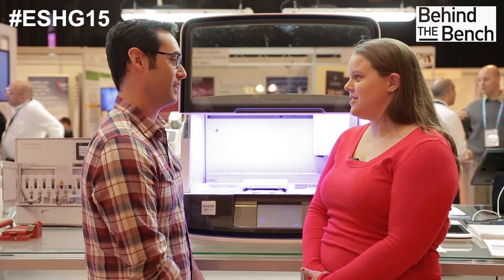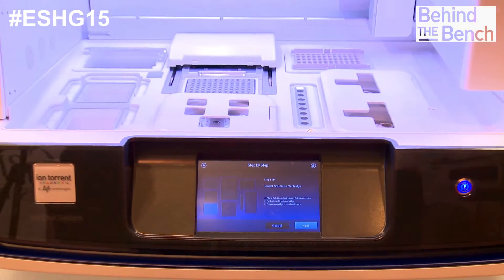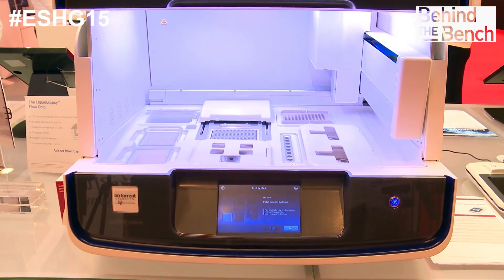Press go. That sounds like a really simple workflow. Yeah, it's really amazing. It's 10 pipetting steps in total, probably about 8 to 10 minutes of setup time. Seven and a half hours later, you have pooled, normalized libraries ready to go for templating.